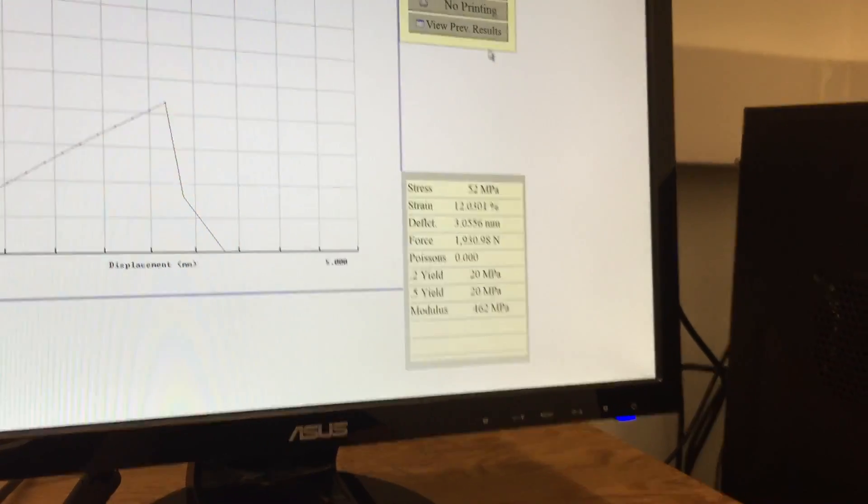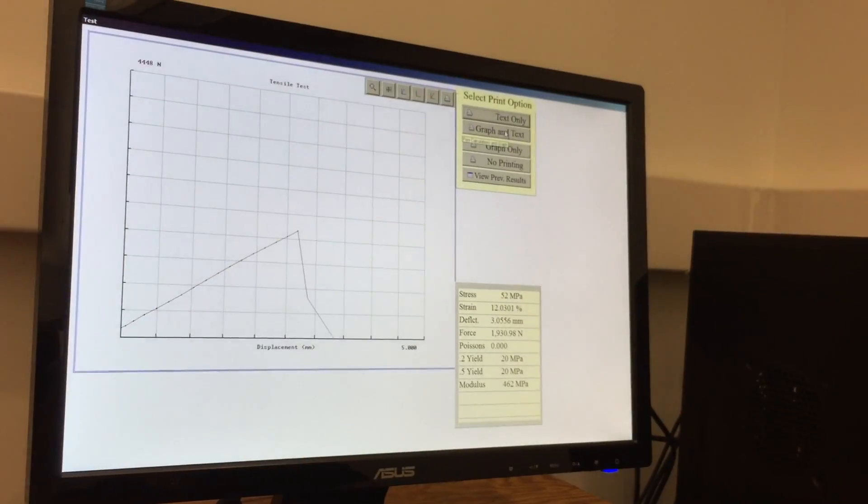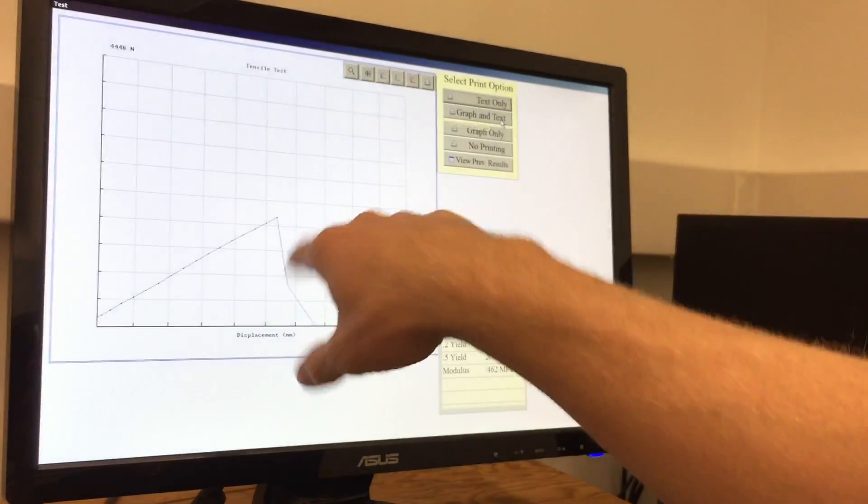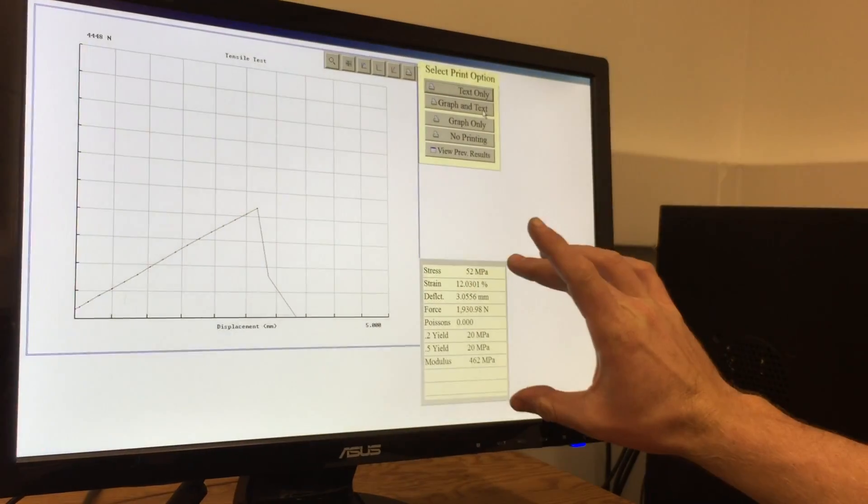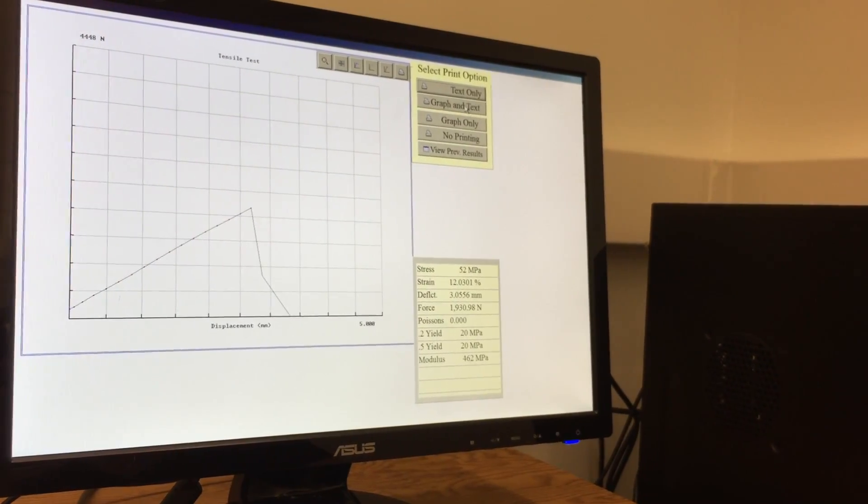And then we can print our results by going graph and text. Make sure to do graph and text. It actually spits out this graph and the corresponding numbers associated with it.